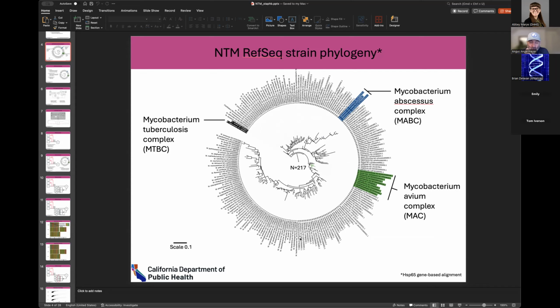Yeah, that's a very interesting point. Obviously I can put any database I want into this. I wanted to start with RefSeq just because I can be assured of the data. I've had a lot of problems in my career using larger, less curated databases, and ended up finding out that a lot of the metadata is wrong, or there are a lot of duplicates, or it'll end up being 30% human DNA or whatever, and just got dumped into the SRA. So I am a little cautious about that, but this is mostly for development, and that's a really good point. In fact, I'm going to write that down and try this with larger databases too, to make sure I'm capturing enough of the diversity.